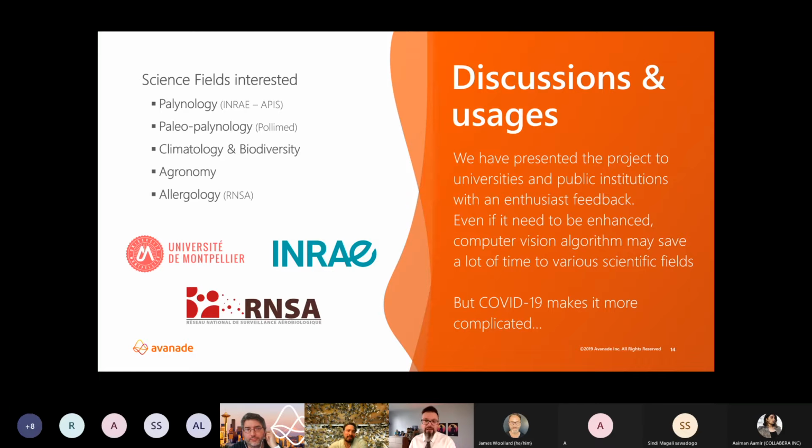So that kind of algorithm is very interesting for a lot of people who every day count and classify pollens under a microscope. These discussions are very important to improve, because we learn from them, because they know how to identify the pollens. And we, Jonathan and me, know how to implement a kind of black box magic that can take the image and say, oh, I have seen that taxon, that pollen, that pollen.